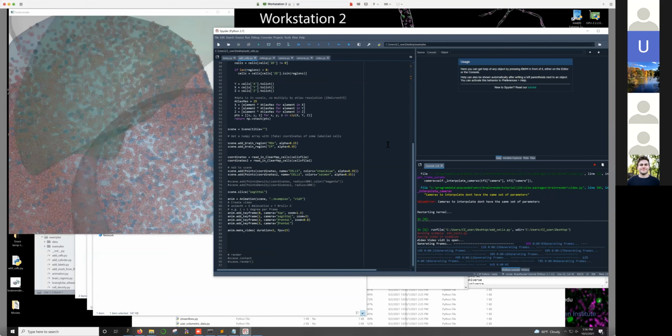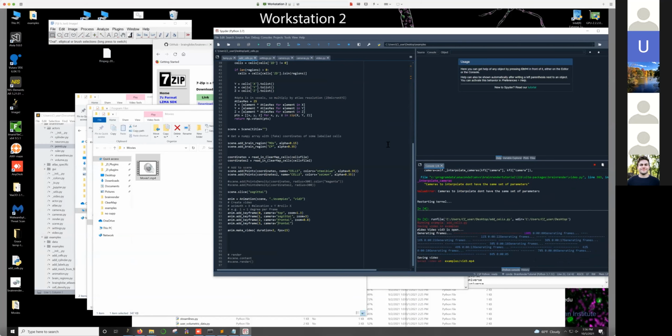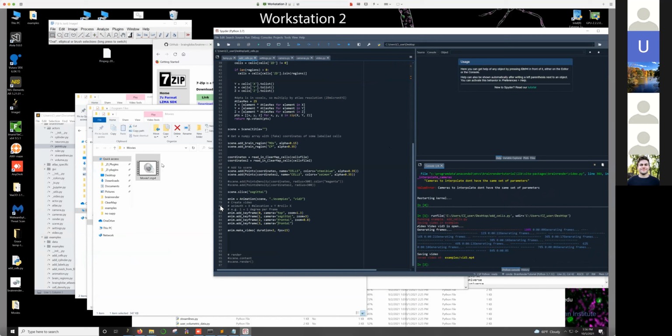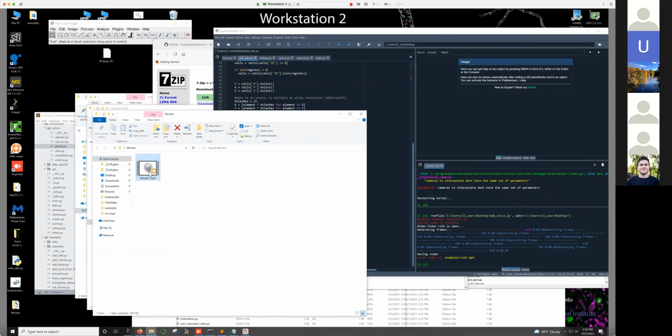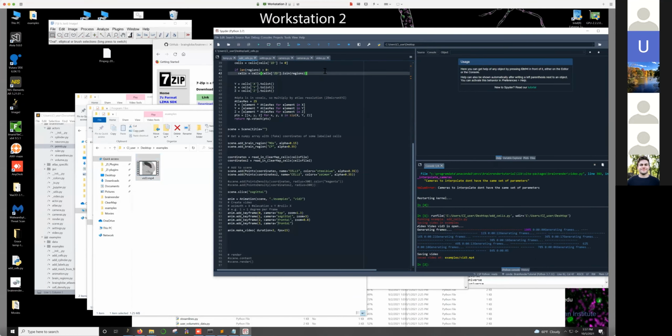Yeah, and these are just quick examples for the tutorial, but you could play around with this to get a different look to the data, and a really nice way of looking at the brain. And then once you've got that done, you don't have to change very much to create really nice renderings. Okay, the final thing that I wanted to show you is looking at raw data.